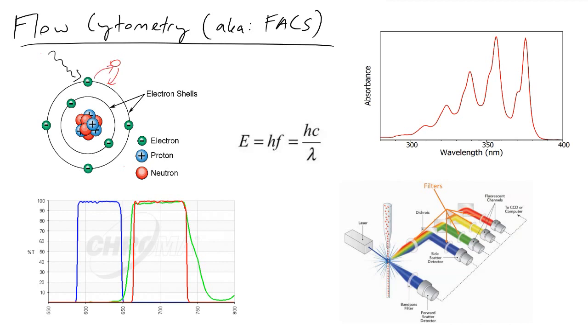And so during this relaxation process is when we see these new wavelengths of photons come out of our sample, and specifically these wavelengths are going to be different. And this different wavelength of photon is something that's very interesting to us because it's basically telling us that a fluorophore is present inside of our sample.